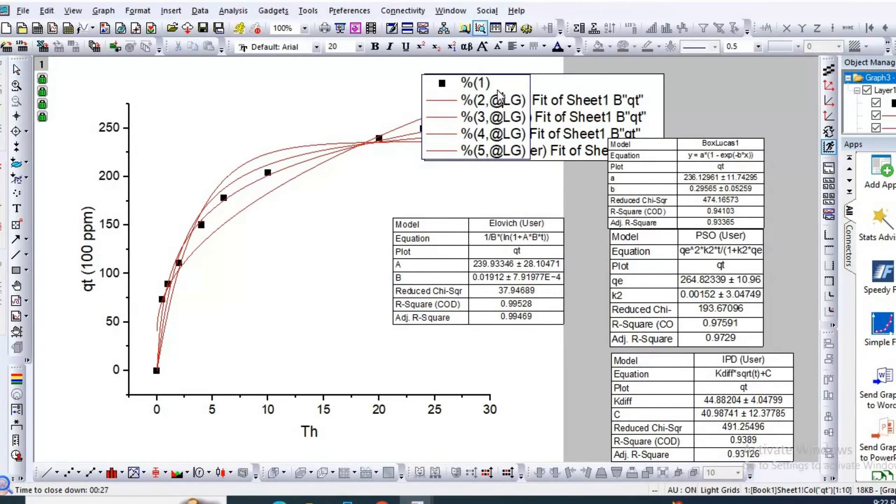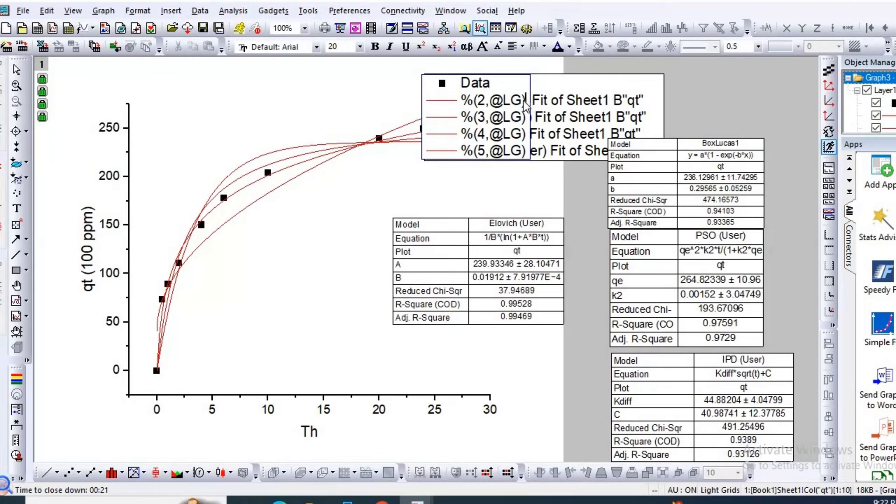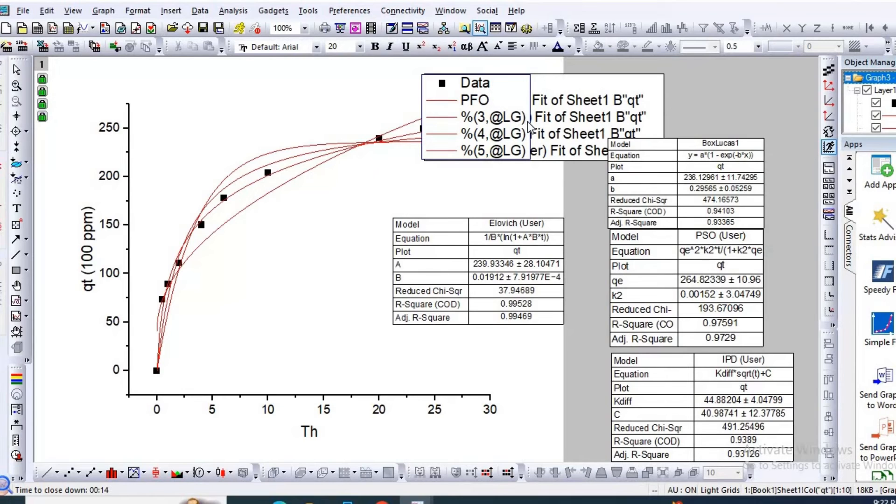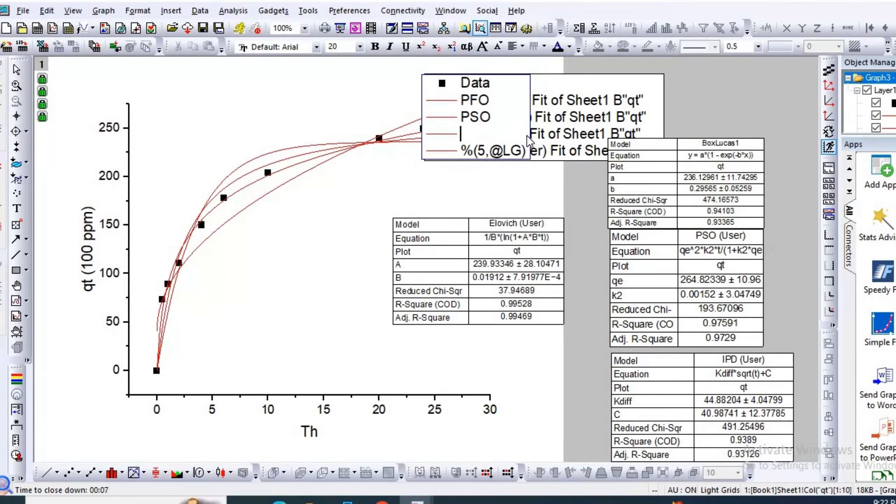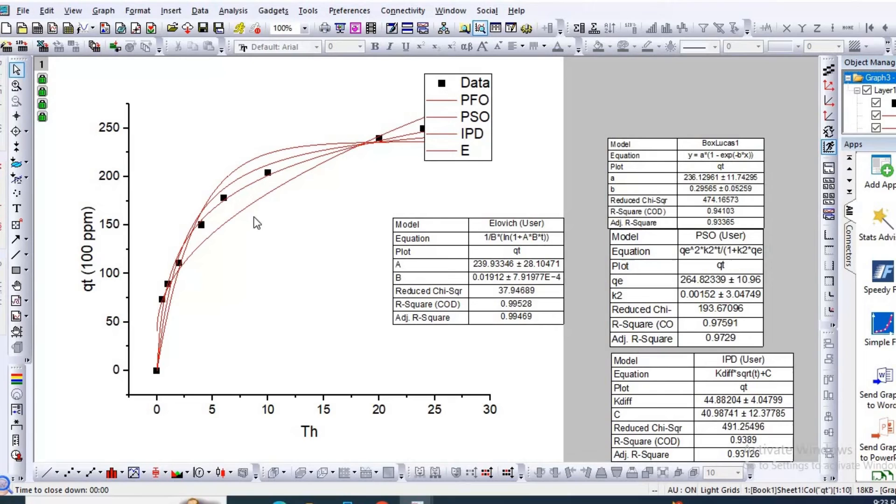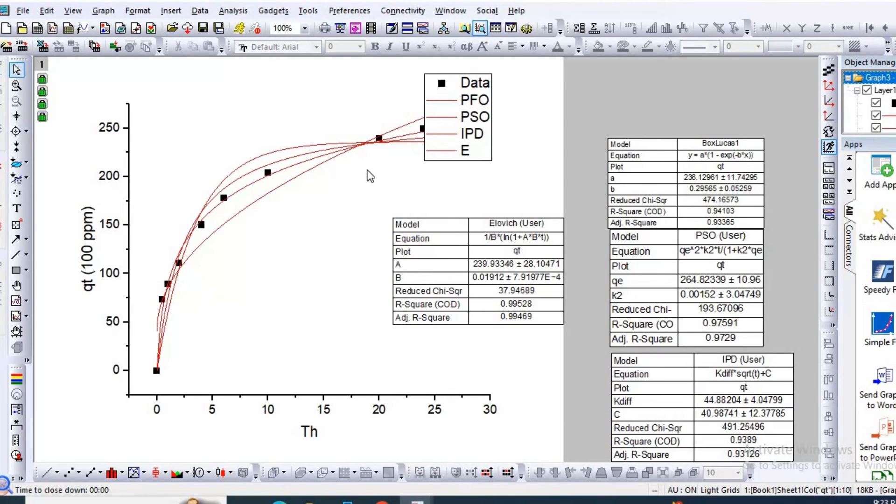Now you can change the legend as Data. Here it is pseudo second order, pseudo first order PFO. Here it is pseudo second order. Here it is intraparticle diffusion model. And here it is Elovich model. So after some modification, you can make it different colors or dot symbols. After some modification, you can easily make it publication quality.